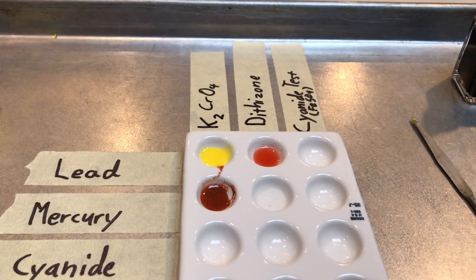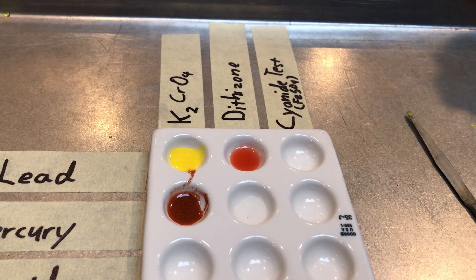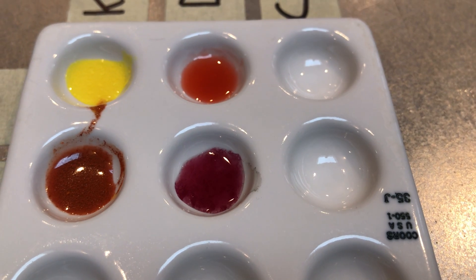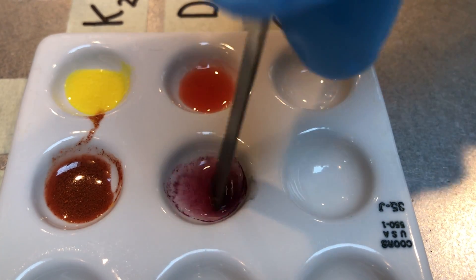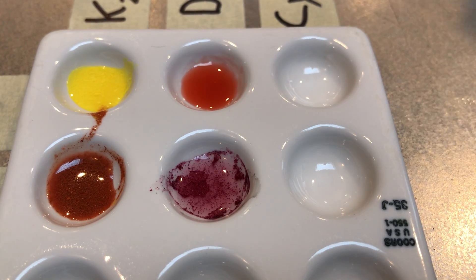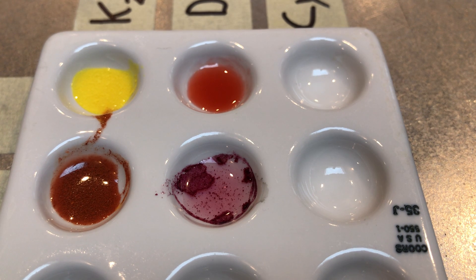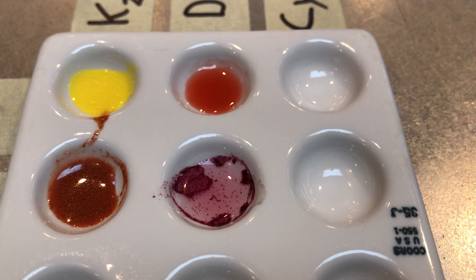Bridget, add two drops of dithizone to the mercury. Now what you see is kind of a dark purple color. Liam, give that a little stir — you can see there's already movement going on inside. It also forms another kind of purple precipitate, but you'll notice it's moving around quite a bit on its own. What's actually going on is the reaction itself is creating heat, which is causing the precipitate to clump up and move around inside the solution.